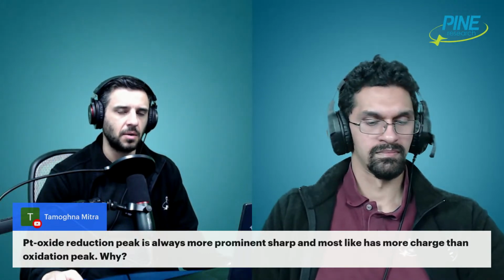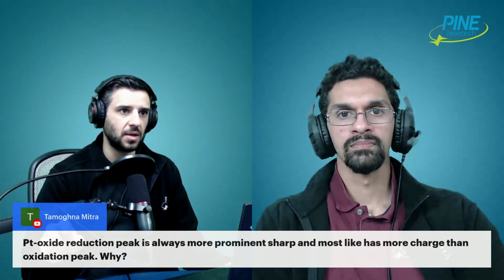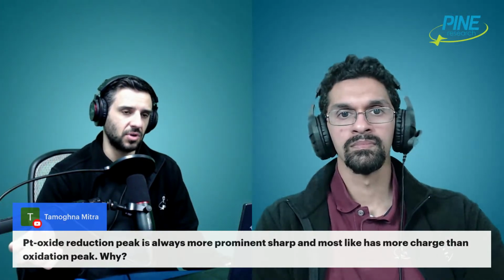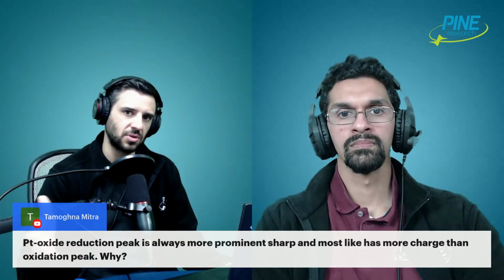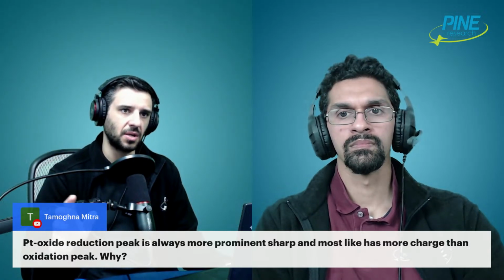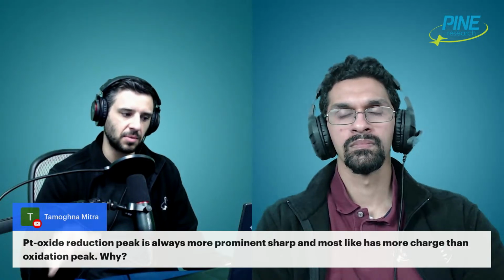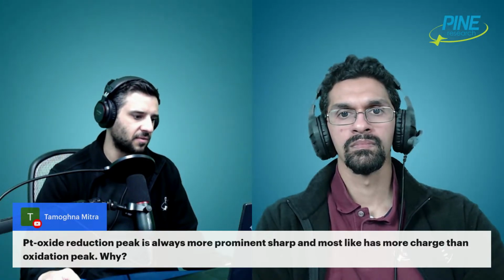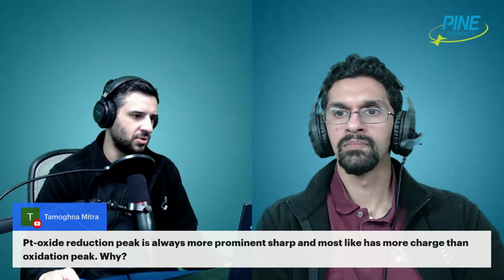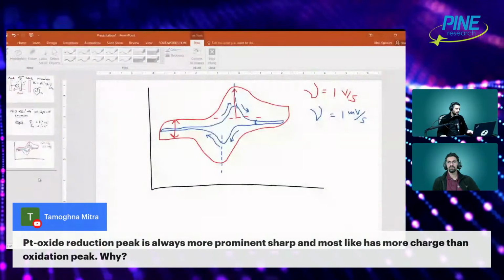So part of that, I think, might have to do with the fact that the platinum reduction peak can also include the oxygen reduction reaction. Now, if you're purging with nitrogen and you don't have any oxygen in your solution, there might be a different explanation. But for instance, if you just have sulfuric acid and you do the platinum, let me share first. You do the typical platinum CV in acidic media.